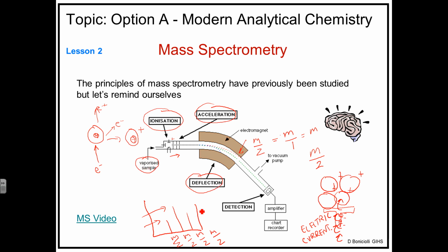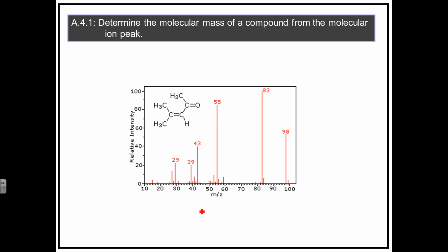Now, in this particular option, we're looking at the ability of the mass spectrometer to break molecules apart. And what you can see here is this molecule has been injected into the mass spectrometer, and the molecule is bombarded by electrons as well. So electrons can hit that double bond, electrons can hit the oxygen that has a couple of non-bonding pairs, electrons can hit that bond, electrons can hit the bonds between the carbons and the hydrogens. So there are lots of places where electrons can collide with that molecule. And effectively, when it does, it breaks the molecule into pieces.